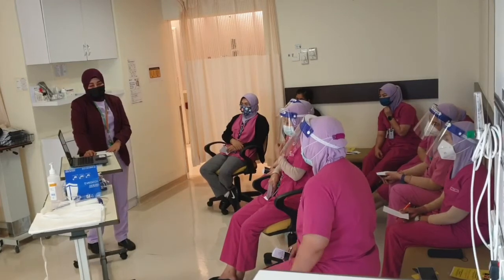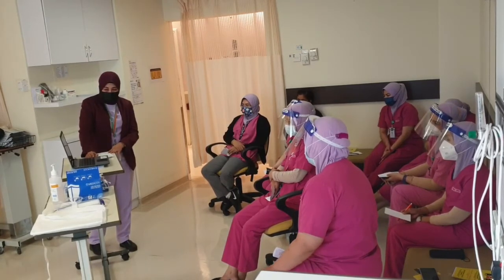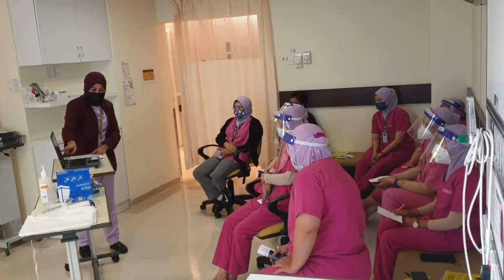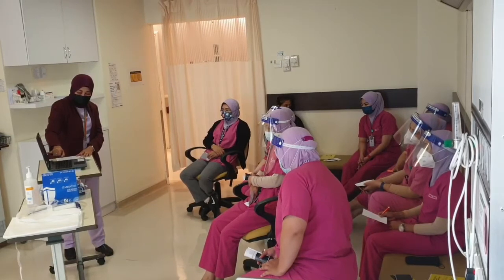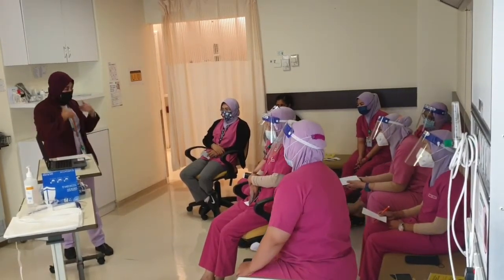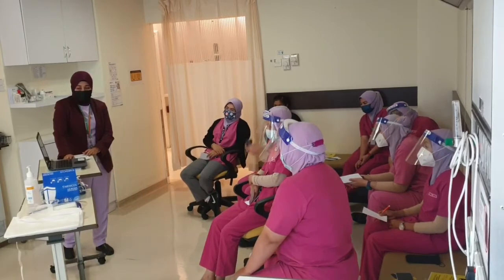Number 4, goggles or face shield. Place over the face and eyes and adjust to fit. Anti-fog feature improves the clarity. See how you need to do it from the top. Not this one, it's wrong. And then this also, you know the difference. Yes, this one no mask. This one is a facial mask. Number 5 is gloves. Gloves extend to cover the wrist of the isolation gown.